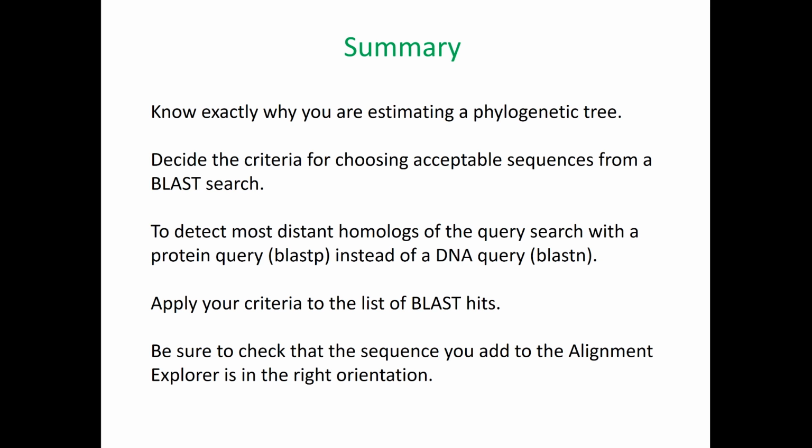Before you add a sequence to the Alignment Explorer, be sure to check that it is in the right orientation, that you're not adding the reverse complement of what you want, or you will follow things up to a fare thee well.